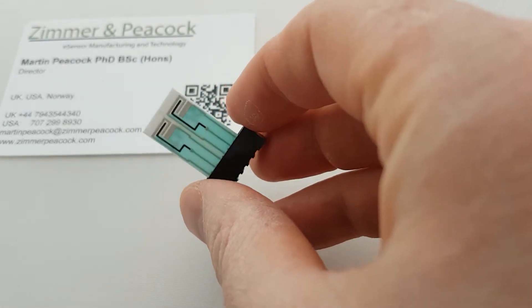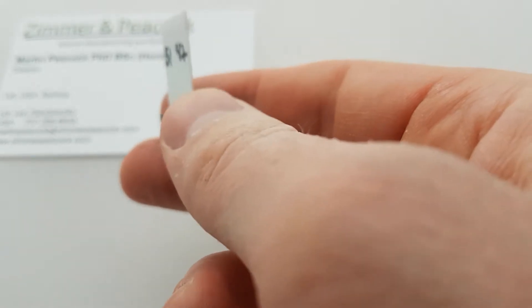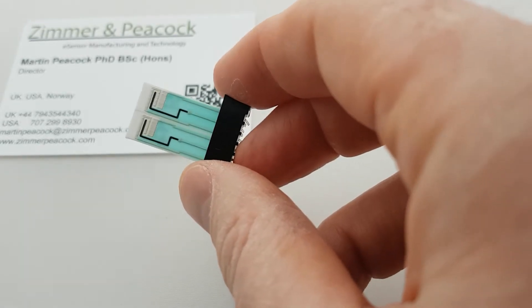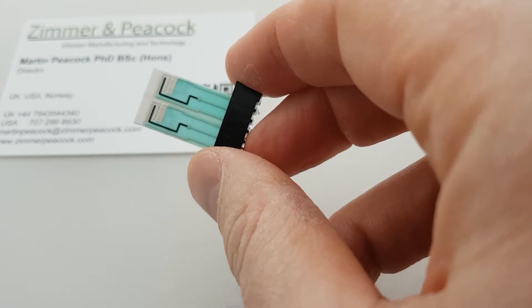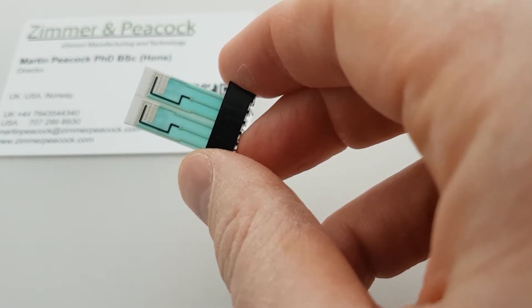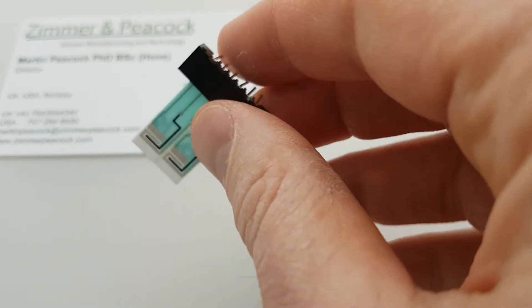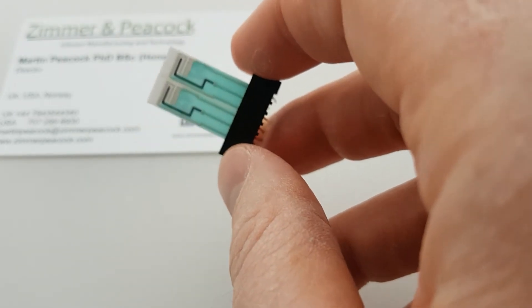The quick answer is we make them in wafers. If you don't break them, they naturally come together as a pair, or in threes, fours, and so on. You can either wire this up as having a common counter and a common reference, or separate counters and a common reference. How you wire it up is up to you, and it's easy to get these types of connectors and make a connection.